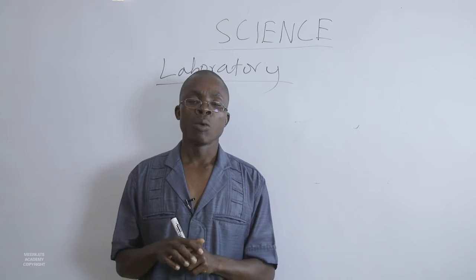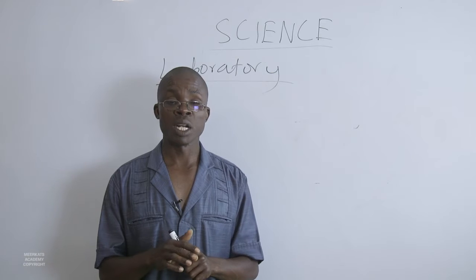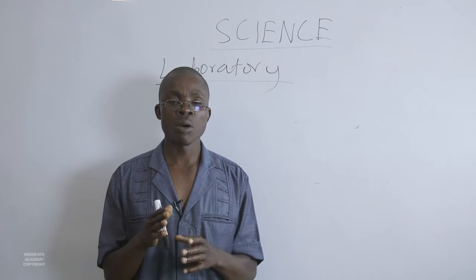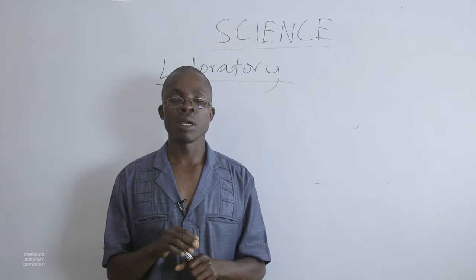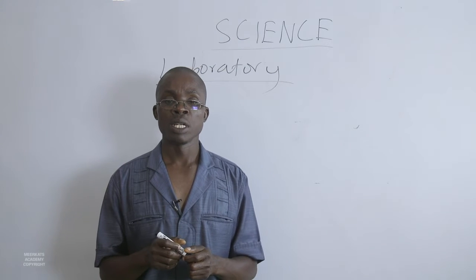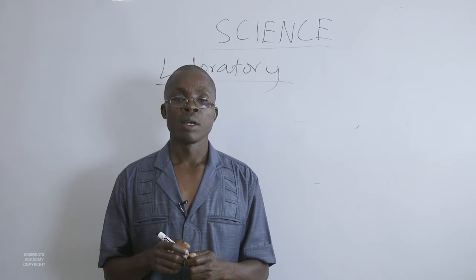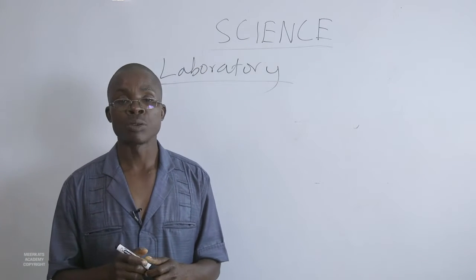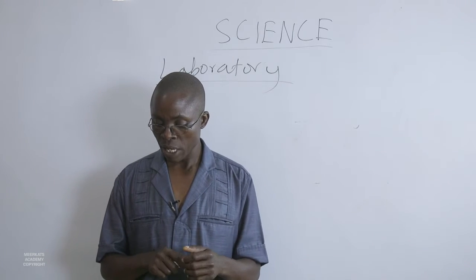So because of that, we also need to know the standard way of drawing some of the apparatus. Some of the apparatus may look almost the same. So without a standard way of drawing them, it may cause some confusion, which is not very good in science because confusion can cause death. No confusion at all when it comes to science, because we always want to get clean work and clean results.